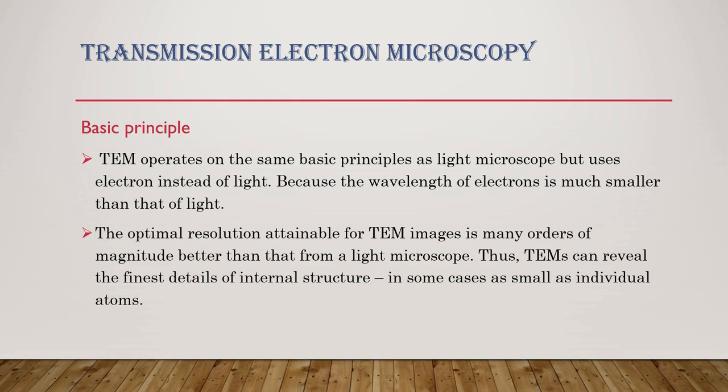TEM can be used to study the growth of layers, their composition and defects in the semiconductors. High resolution can be used to analyze the quality, shape, size and density of the quantum wells, wires and dots.